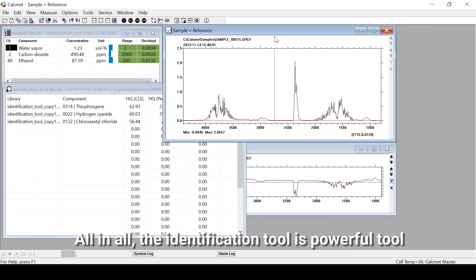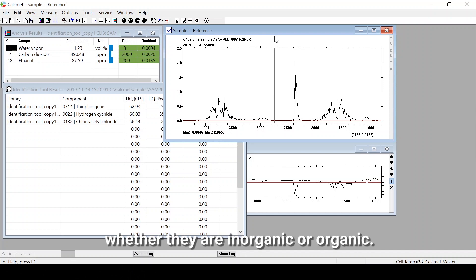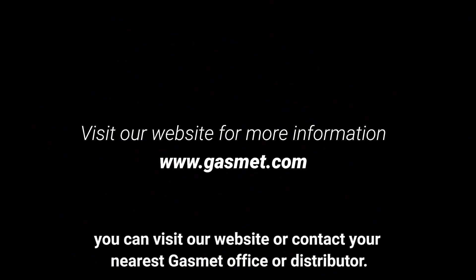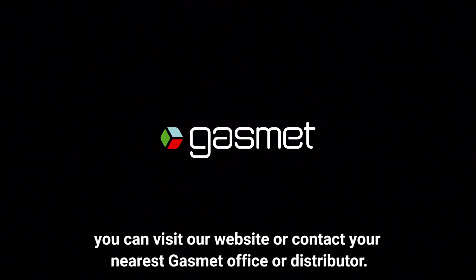All in all, the identification tool is a powerful tool that you can use to identify all unknown compounds in your sample, whether they are inorganic or organic. If you have any questions or want to know more, you can visit our website or contact your nearest customer office or distributor.